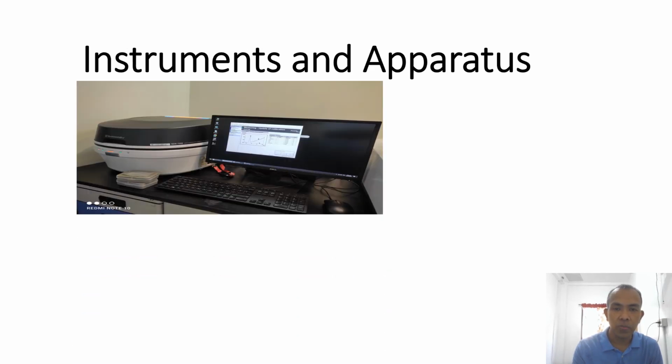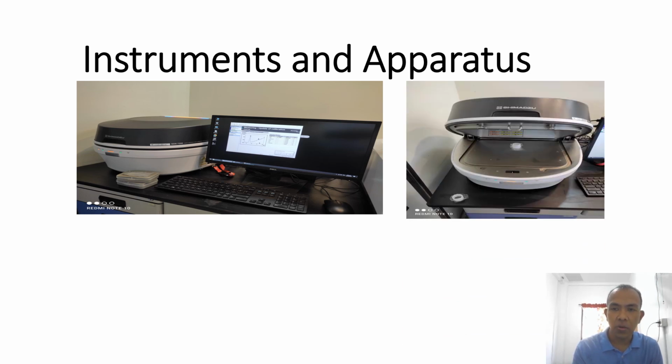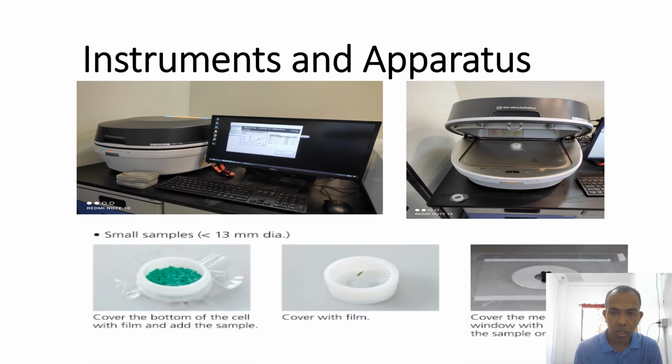So this is the actual picture that I use in Shimadzu office in BGC. This is when we open it. This part, this is where we place the sample here in this part, and then bablock siya ng ano ko, ng video ko.